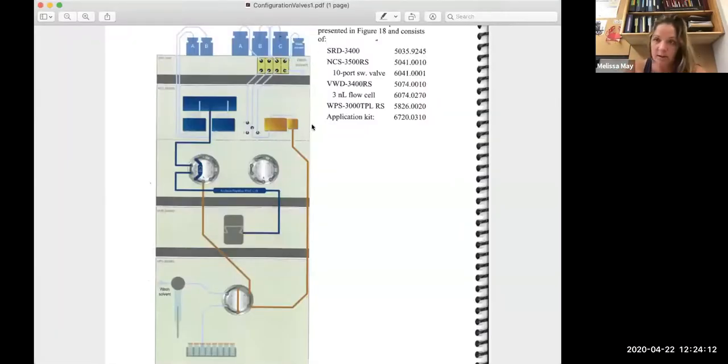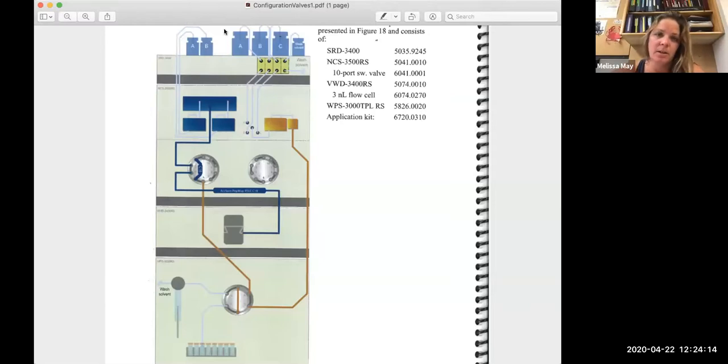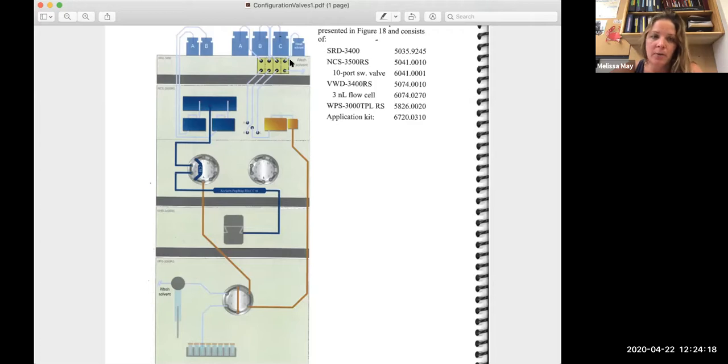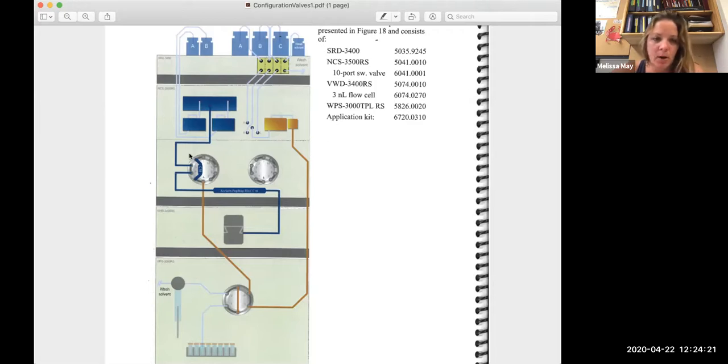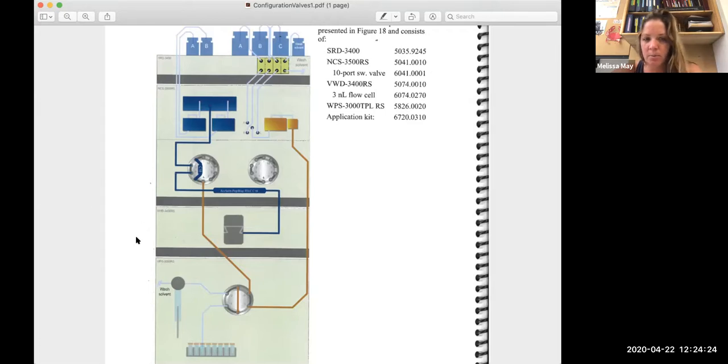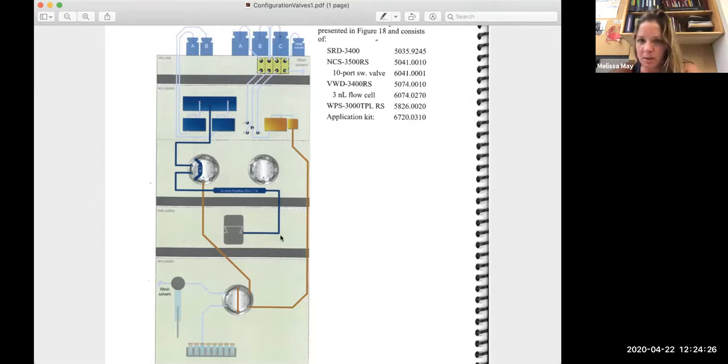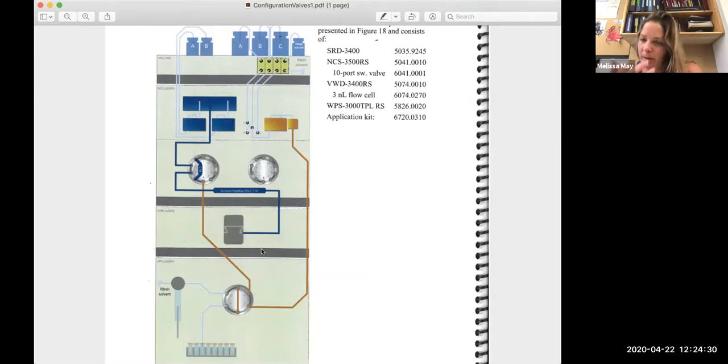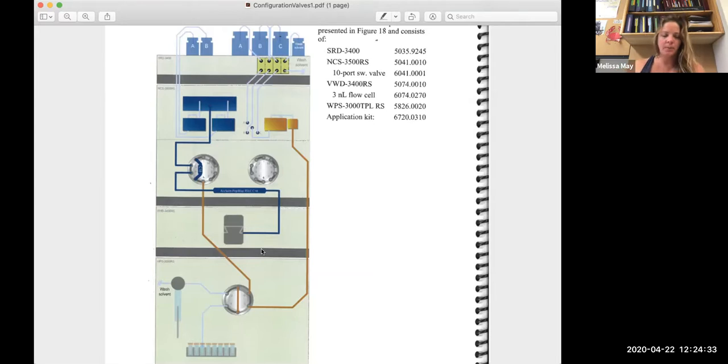If we look at our configuration, this is similar to what we saw of the setup of the LC. Over here we have our solvent bottles in our solvent rack, this is our degasser, this is our pump module, this is our column module, and this is our autosampler. You can ignore the central component right now, but effectively that's going to be the mass spec, or if you didn't have a mass spec hooked up, this would be your UV analyzer.